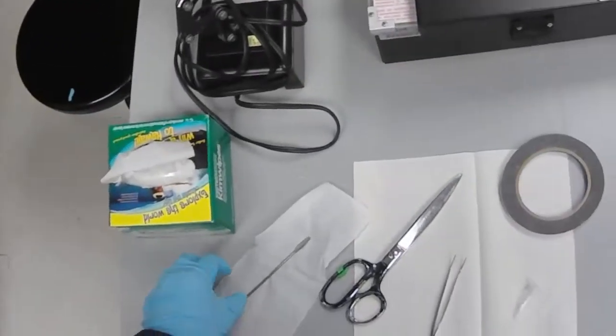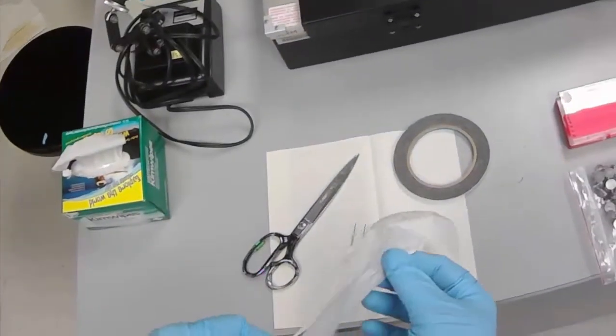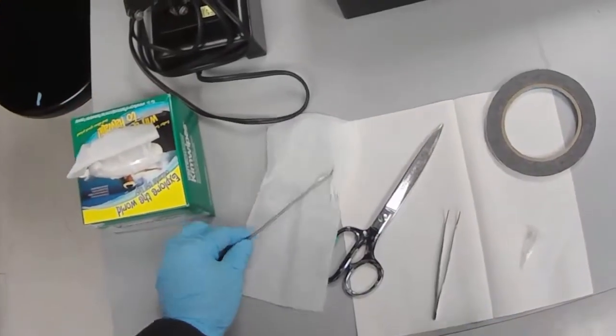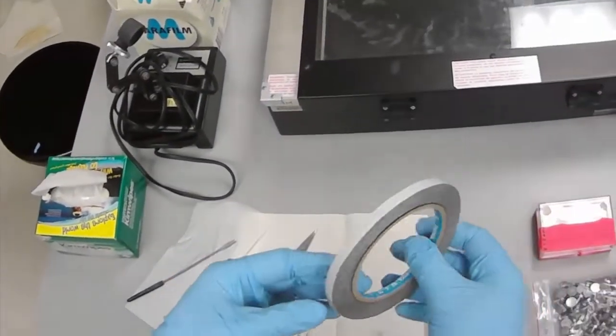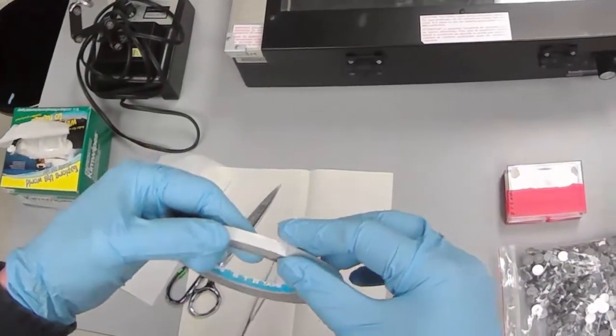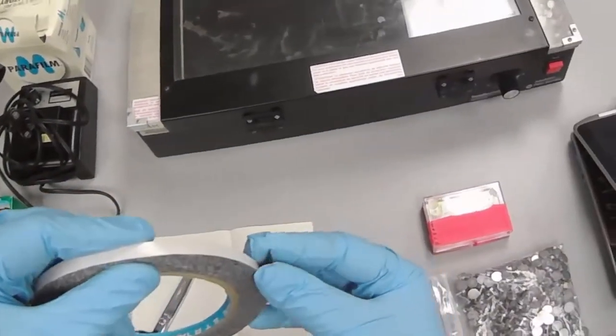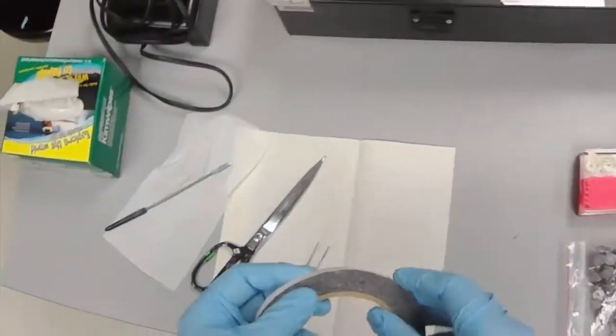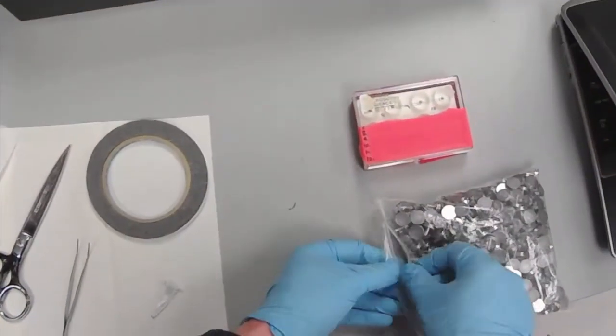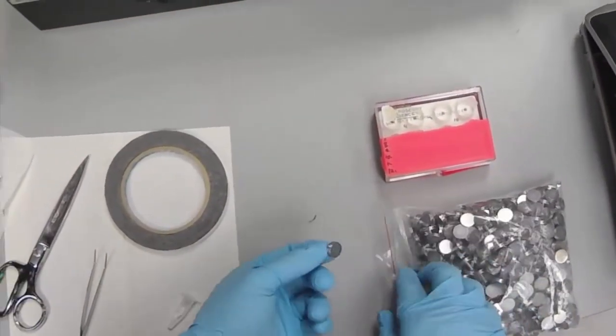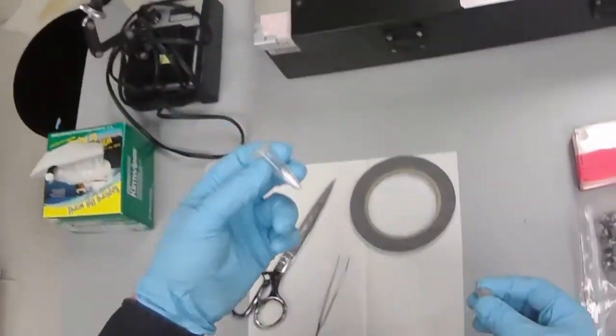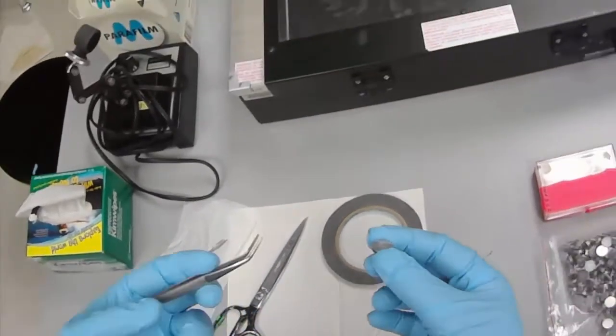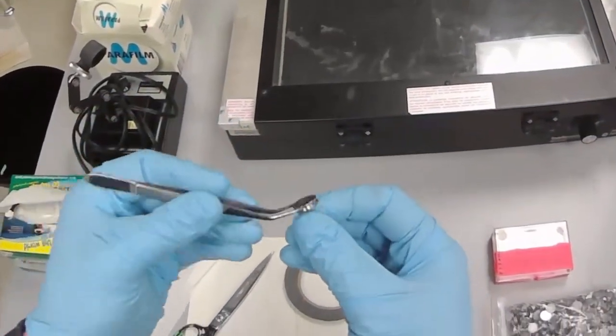To prepare our sample for the SEM, we want a clean micro spatula, a pair of scissors, carbon tape. This is double-sided tape that is embedded with carbon black so that it conducts electricity, an SEM sample holder, and of course our sample, and forceps help with manipulating the sample holder.